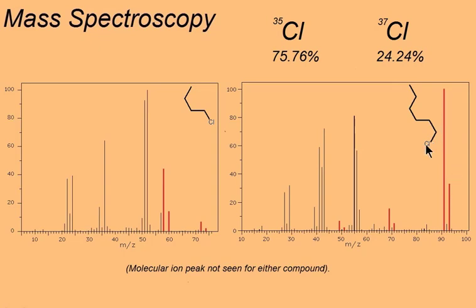Again, the peak from the chlorine with 35 mass is usually the one described as the molecular ion peak, and the second peak, which is just a third of the size, is described as an M+2 peak. And just as we said with bromine, to be sure that this just isn't a fluke occurring at this end of the spectra, look to see that 3:1 ratio separated by 2 units further down the spectra, where we have smaller fragments when the chlorine is still attached.